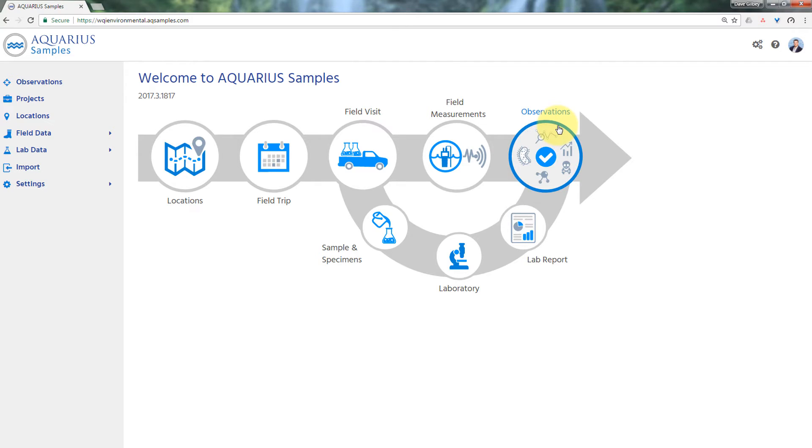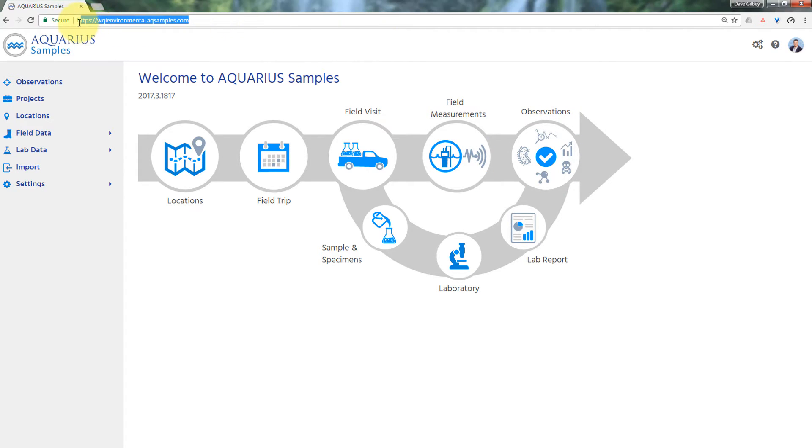Some things to know about Aquarius Samples, each organization gets their own unique database and with that comes its unique URI, which I've highlighted here in the address bar.